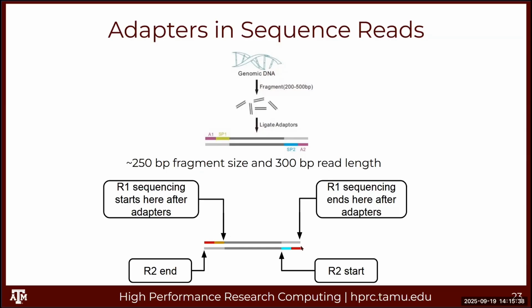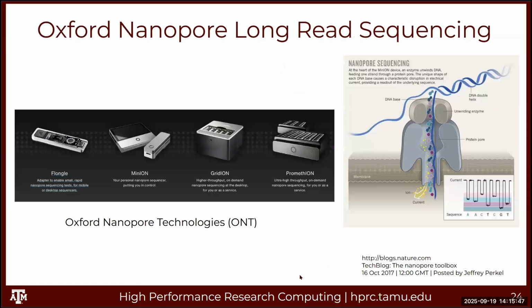Same way with the bottom. It starts at the bottom. It can read all the way to the end. But if the fragment's really long, it doesn't read the adapter. So some of them will have adapters. A lot of them will not.